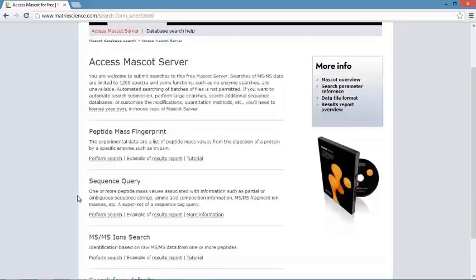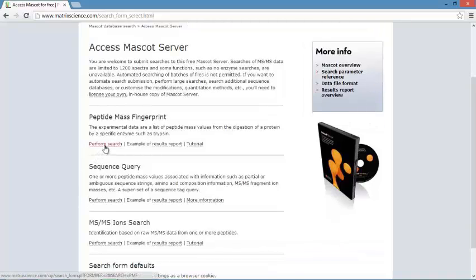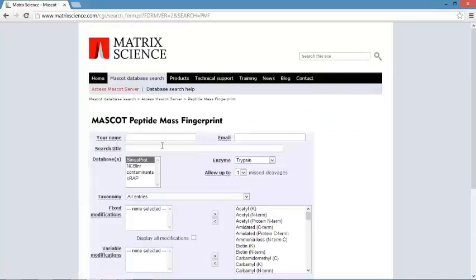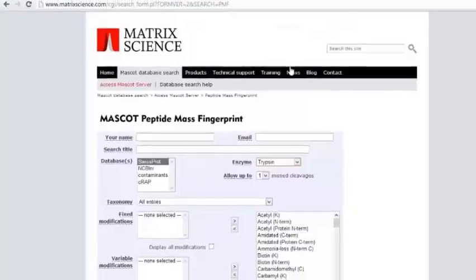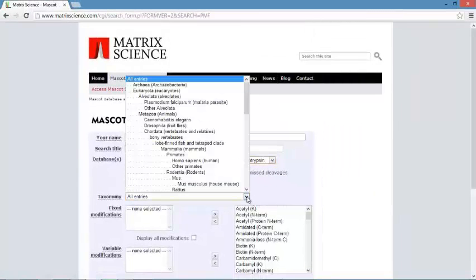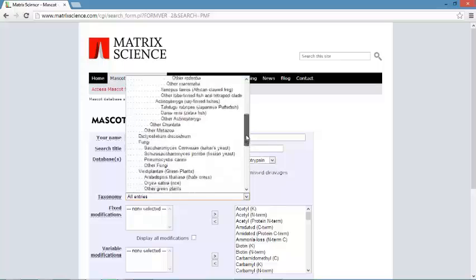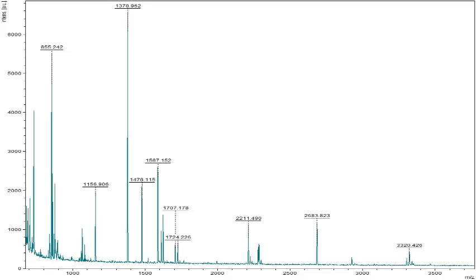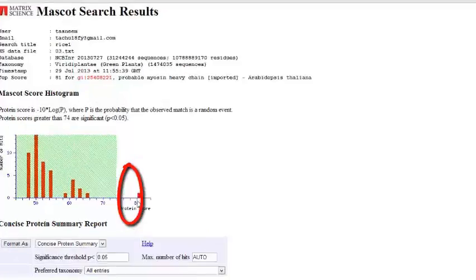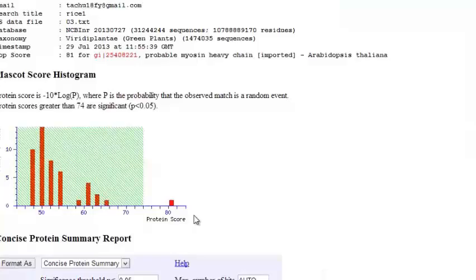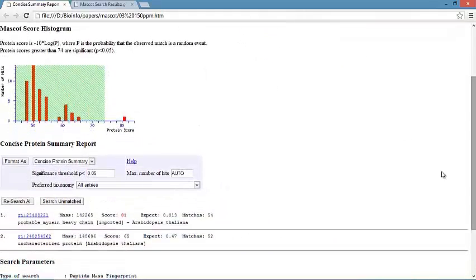The Mascot server is used to match the mass value to the protein sequence. The search can be performed using peptide mass fingerprint. To perform the search, we have to fill in the query box; it gives information for databases, enzymes, and taxonomy. We can choose the fixed and variable modifications. Peak values are obtained from MALDI-TOF, which are used to analyze the mass spectrometric values in the Mascot server. The result contains protein mass, score, expect, and matches. Protein scores greater than 74 are significant.